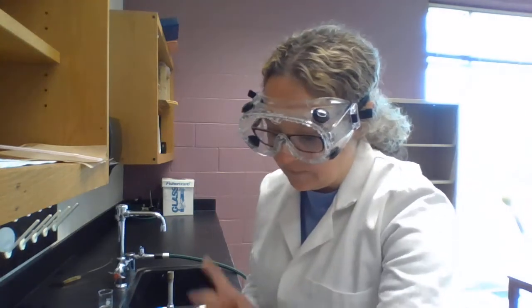Magnesium in the presence of oxygen. So this is a synthesis type A, according to our reference tables. We are creating a binary compound, magnesium oxide. Now, if you look, it asks us to mix the magnesium oxide with water.